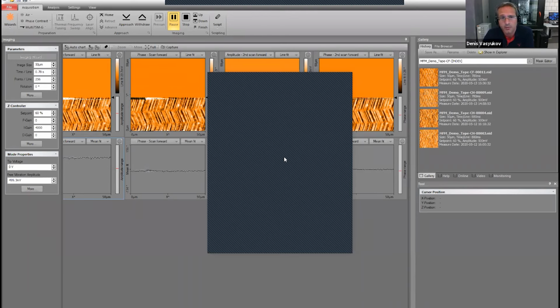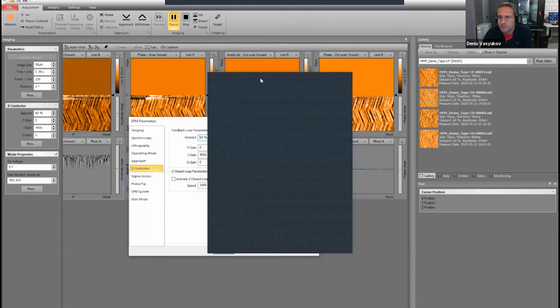Even then, when we knew exactly the field, we would still do extensive micromagnetic simulations, and only then could we make any conclusions about what is happening in the material and whether our scientific logic is valid. So without the simulation, you cannot just say you see this or that in your measurements. You have to simulate. So this is the answer to your question.